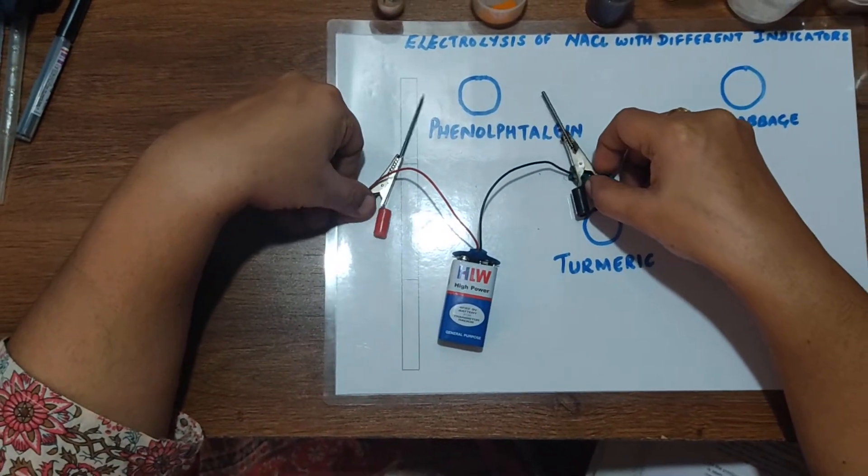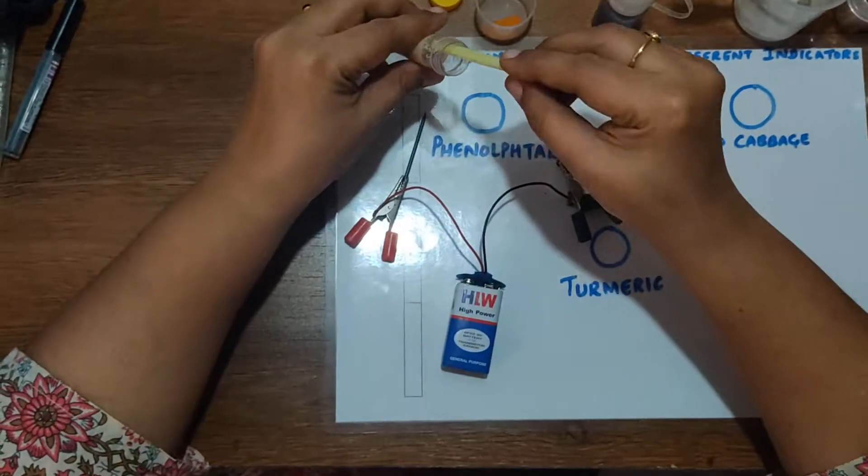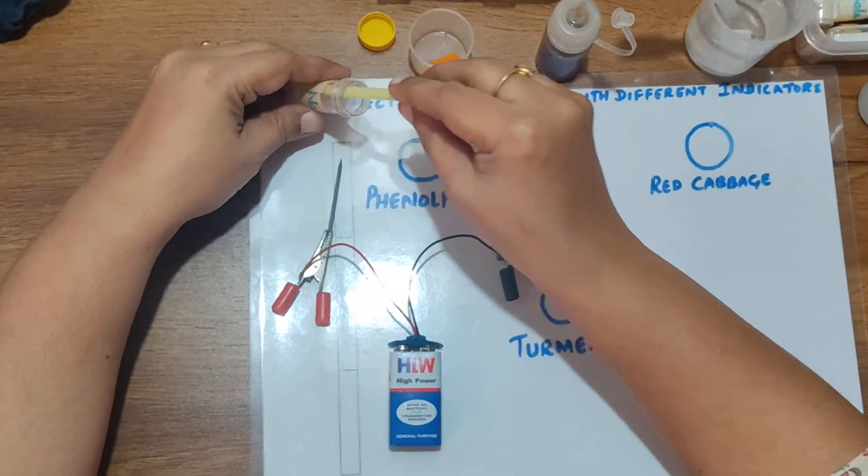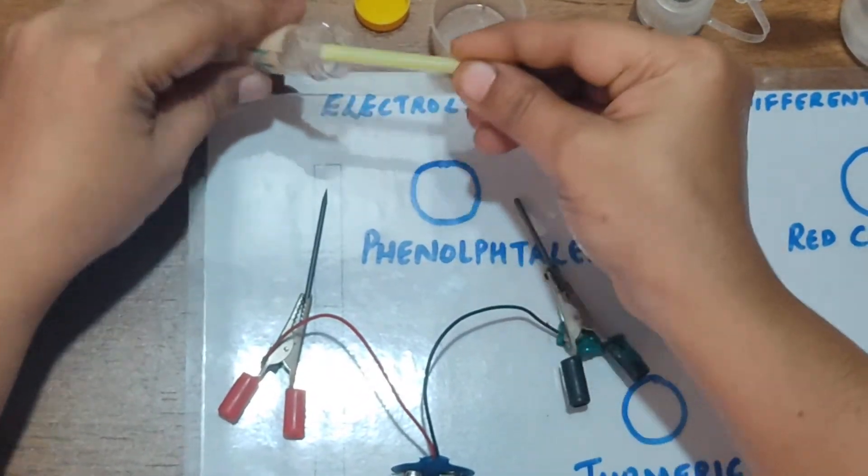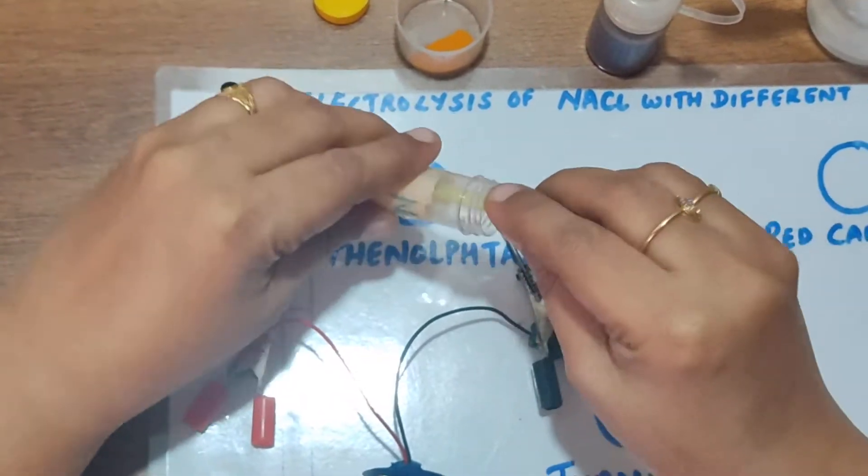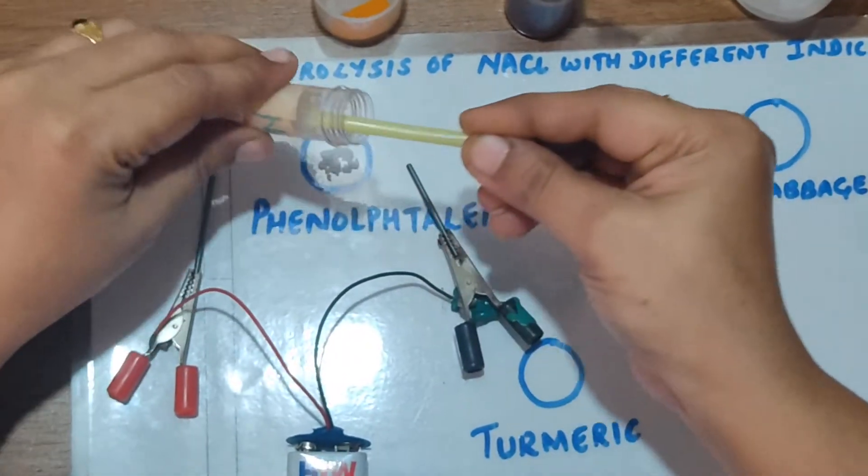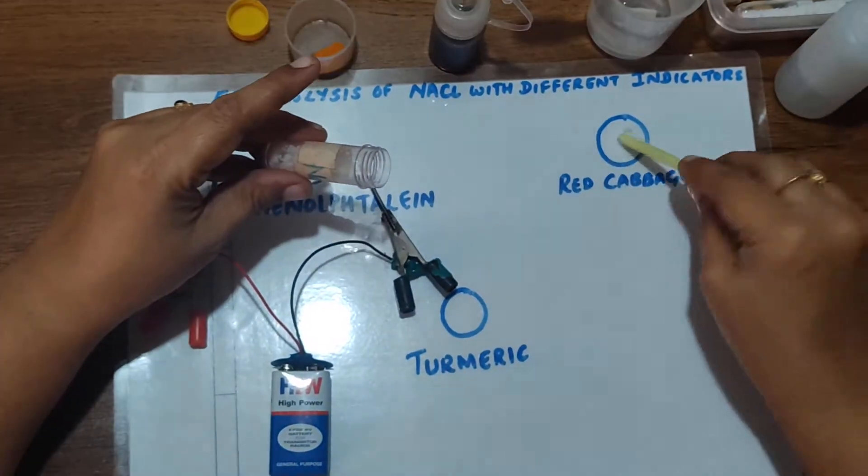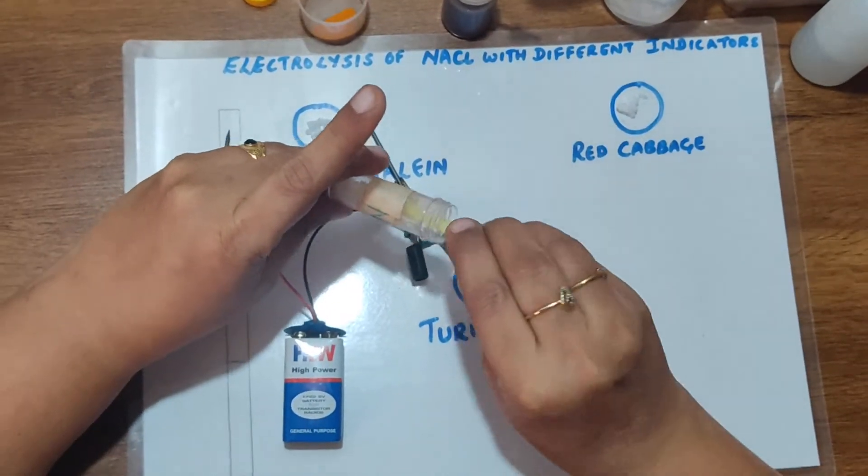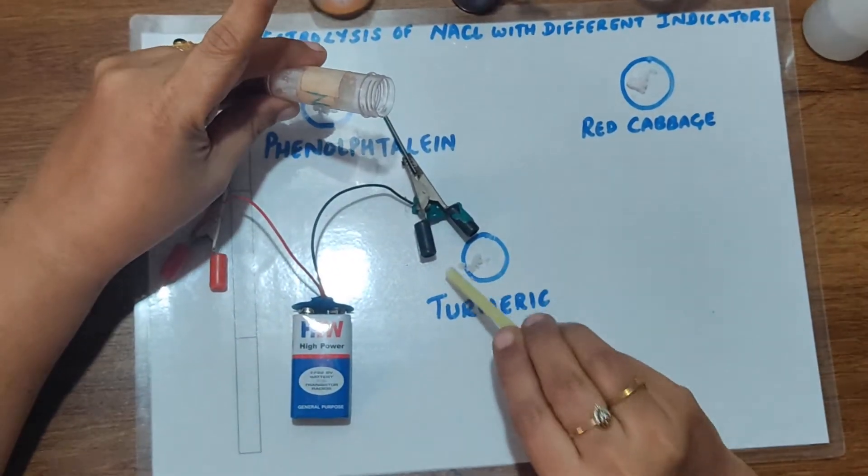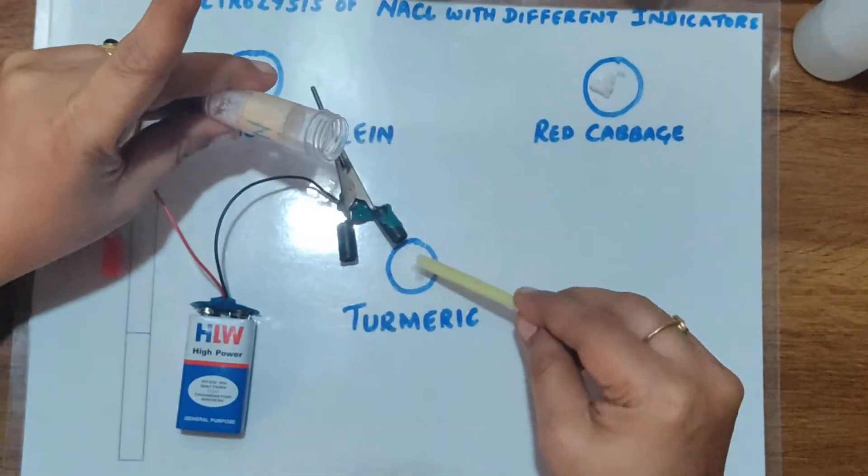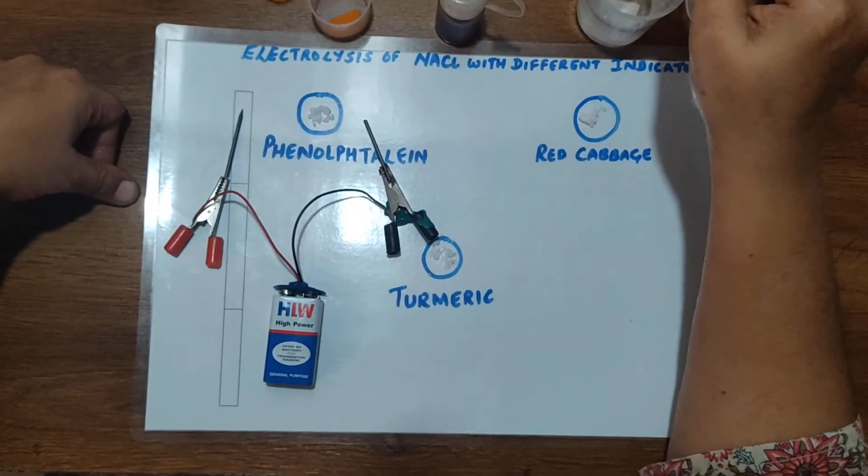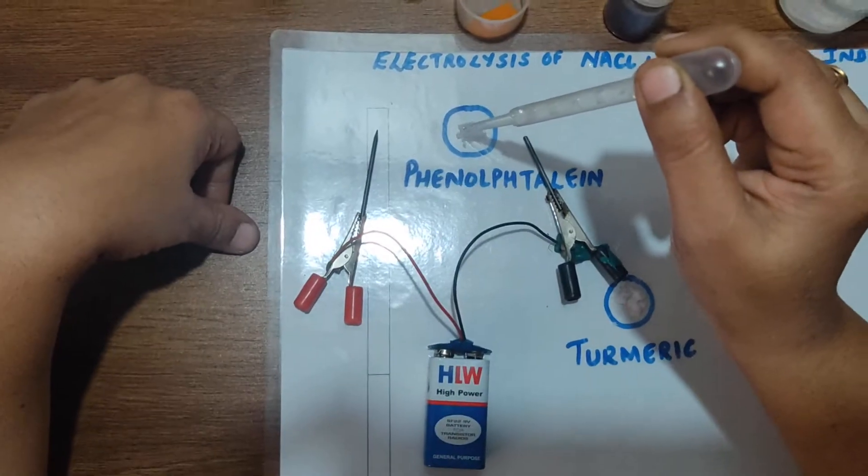Now let us perform the experiment. I've drawn three circles here. Let us transfer a small amount of sodium chloride into the three circles. You can see I've just used micro milligrams of the chemical here. Now let me add some water in the three circles to make it a solution.